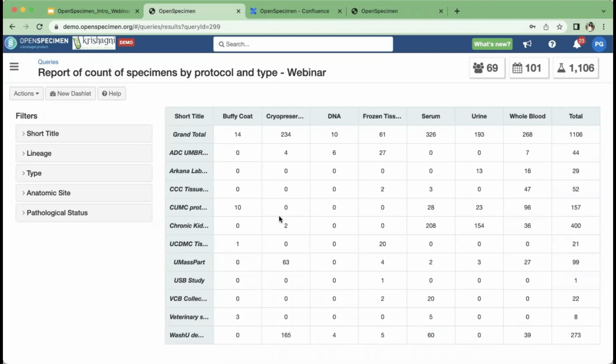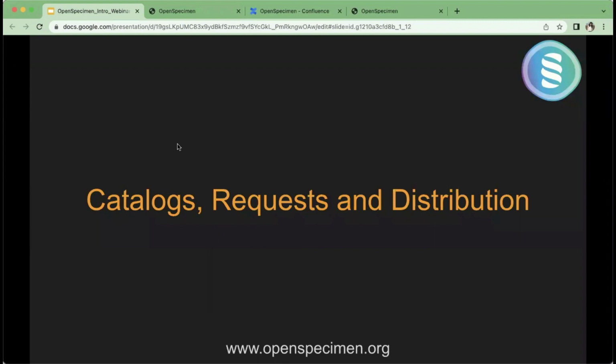So you can either do the raw data-based report, which we saw earlier, or these kinds of pivot table kinds of reports that you can do. And these can as well be scheduled. You can export this into a CSV and so on. So the reporting tool is very robust and it has a lot of different functionalities. What we saw right now is a very small percentage of what you can do through the queries. So let's move ahead with others.